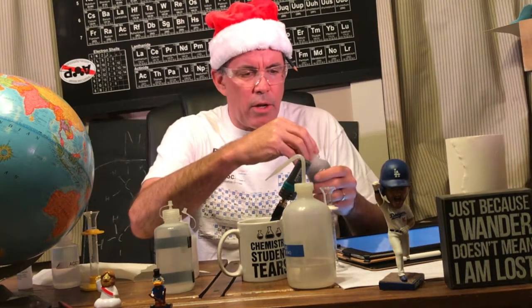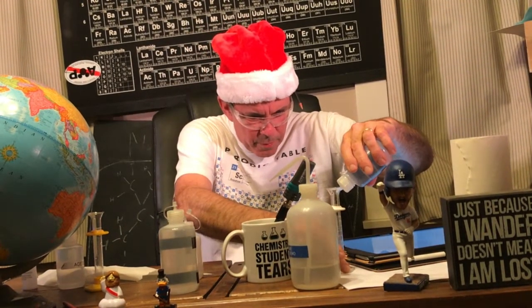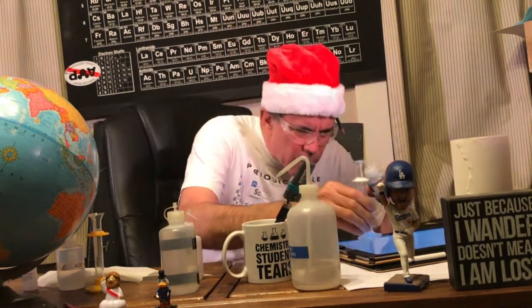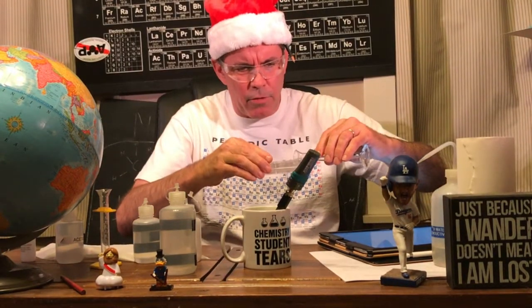So what I'm going to do is take a graduated cylinder and I'm going to add 1 milliliter of 1.0 molar, and I'm going to dilute it with 9 milliliters of deionized water to a new volume of 10 milliliters. And that is like cutting it to 0.1 molar. And I'm going to mix it well. And then I'm going to pour some in this spot plate and measure its pH.